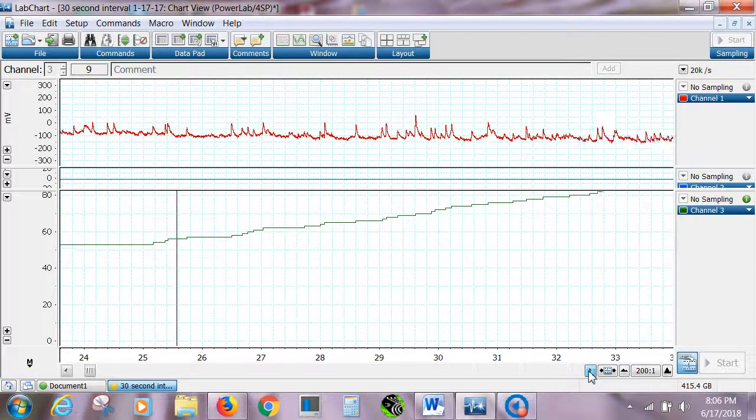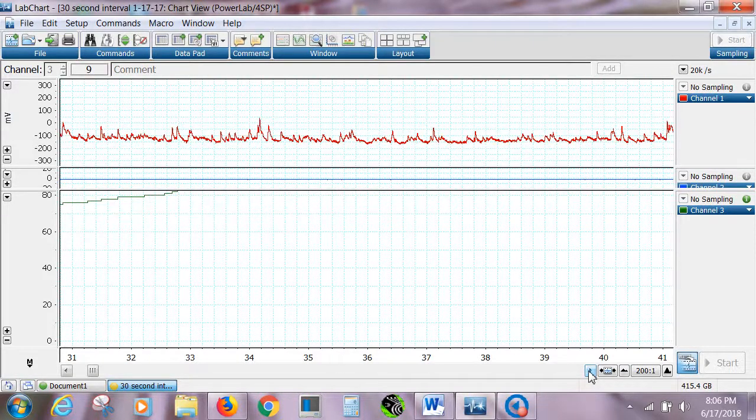So this is why by hand counting seems to be better than by automated analysis. There are some more comprehensive analyses where one can put little stars in there, but then again, you're doing it by hand.